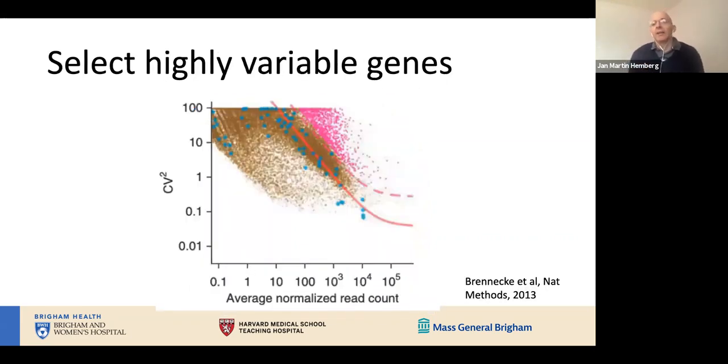This is an example of what's called feature selection. By feature, we mean gene here, really. So the idea is to not consider all of the genes in your sample, but only a subset. One of the things that you should always do is look for the genes that are really lowly represented. Typically you would use a threshold of a few percent. So if a gene is present in no more than a few percent of the cells, then you just take it out altogether. That can typically reduce the number of genes by a few thousand. It really depends on how deep the sequencing is.